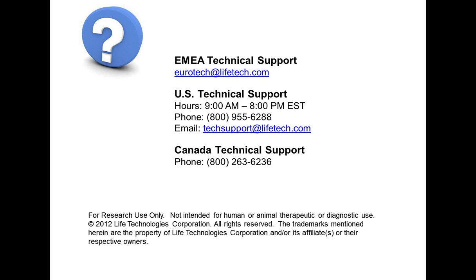So there's a question about do dead cells have more or less emission? And if you're looking at forward scatter, cells tend to decrease in size. And if you're looking at side scatter, dead cells tend to increase in side scatter as they die. But really the best way to determine what a dead cell is, is to use a dead cell discriminating dye.